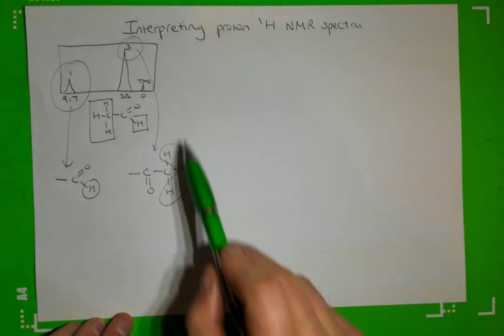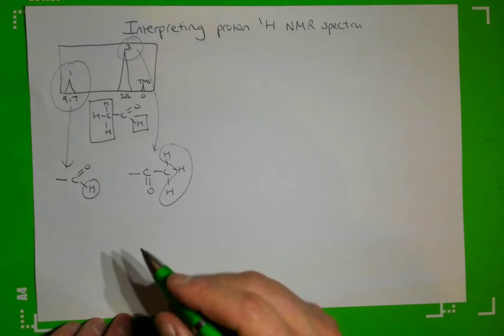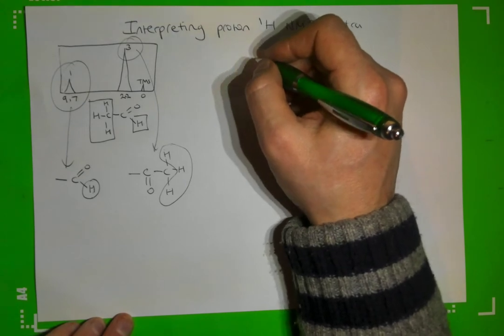Now something a bit more complicated than this. Okay, we're going to look at spin-spin coupling now, sometimes called spin-spin splitting or splitting.